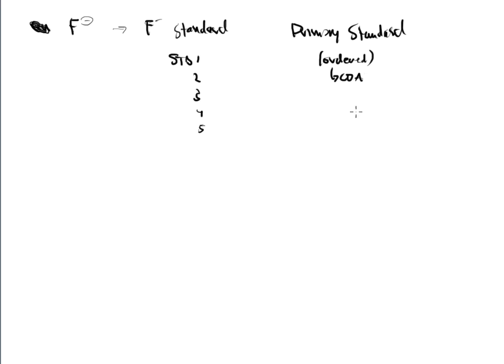This basically means that if I order a 1000 ppm fluoride standard, then there's going to be a certificate that comes along with that that says this is tested, this has been made, we have results that show it is 1000 ppm. So that way you can use that paperwork on your end to say, yes, I have proof this was a 1000 ppm fluoride standard, and I have used this standard to make all of my other ones.